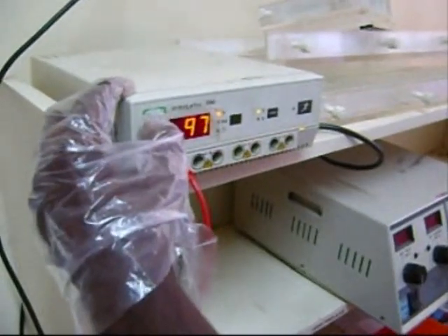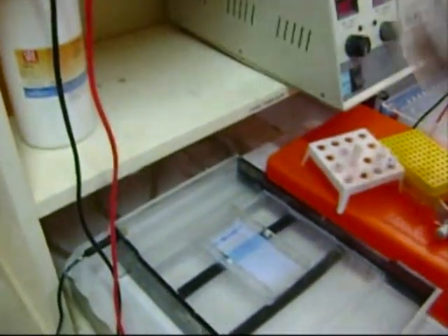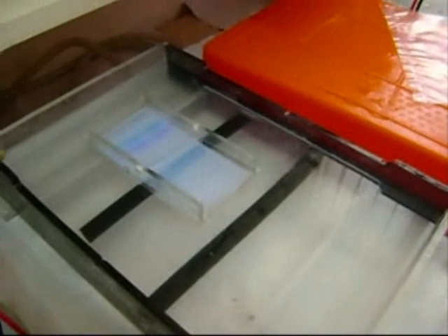In this way all the wells are loaded and the power pack is set at 100 volts and is switched on. The gel is allowed to run for 20 minutes, after which the power pack is switched off and the gel is removed from its template.